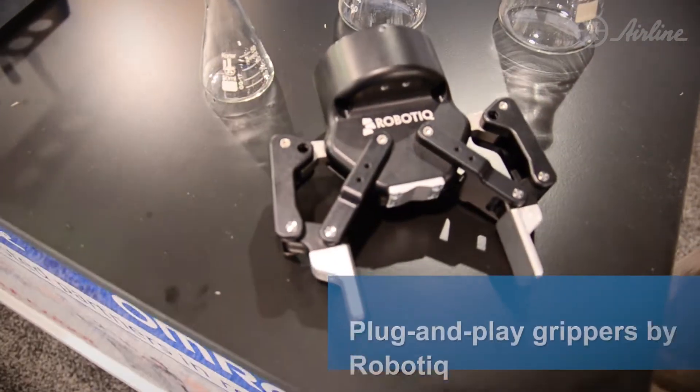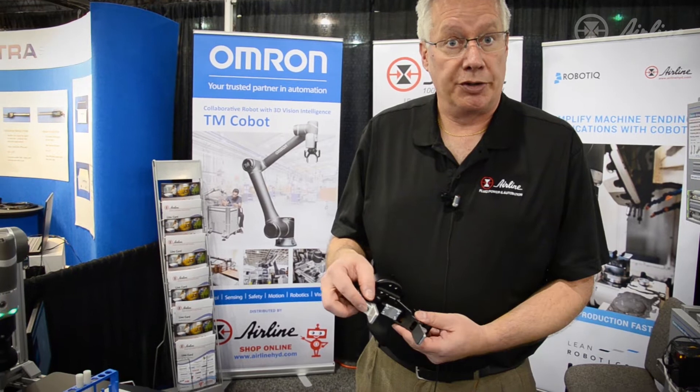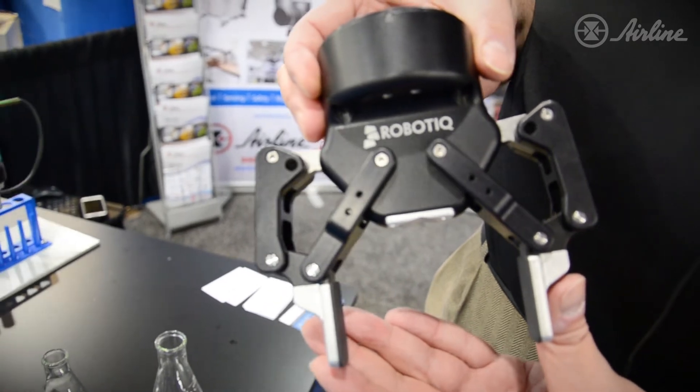The Robotiq gripper is available in a variety of sizes. The finger is released very easily with one screw on each side. These can be custom machined or they can be 3D printed to match your requirements.